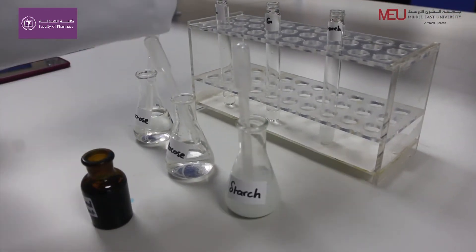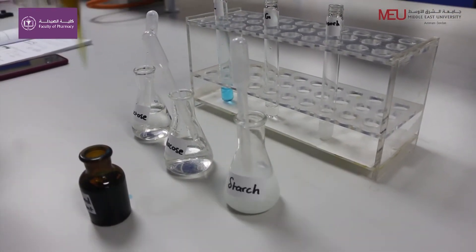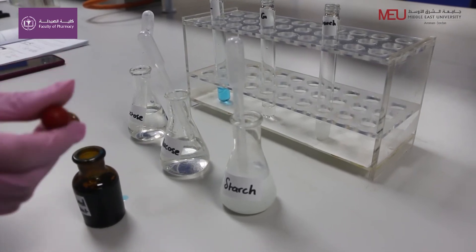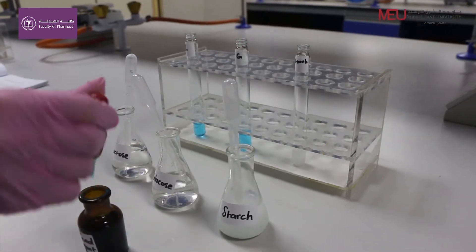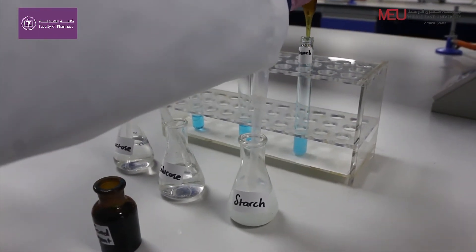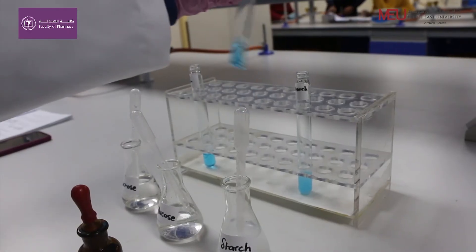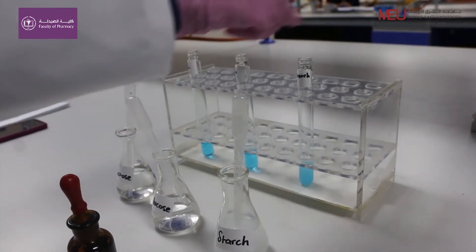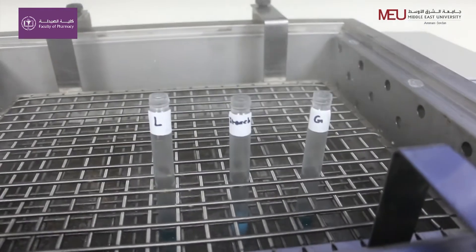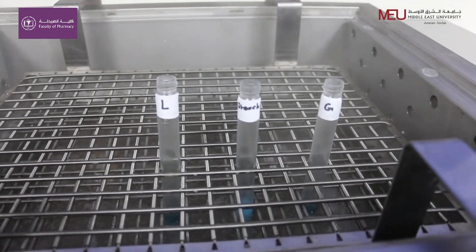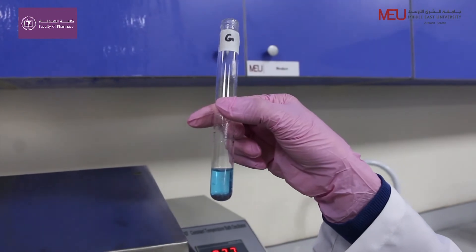Add 2 ml of solution of glucose, lactose and starch. Mix the contents of the tube and place them in a boiling water bath. Observe the tubes during the first 5 minutes and remove any tube that becomes cloudy or changes color. Report your observations and notice the time of positive reaction in each tube.